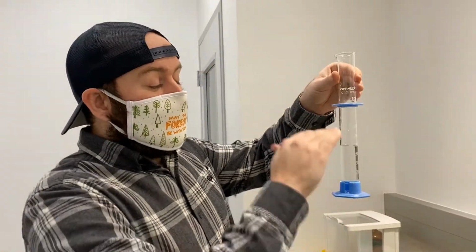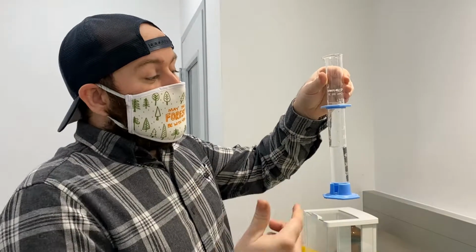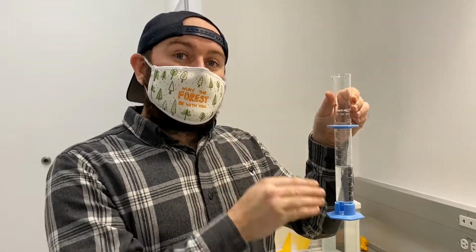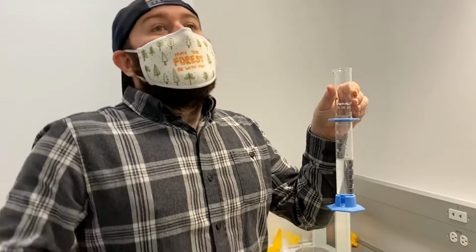Now I need to measure the volume on this, but unlike the last graduated cylinder we used in the first video for this lab, the increments have changed. Now our increments are at 1 mL each, so every milliliter we see a line. This means that we need to record to the 10th place on our graduated cylinder for volume.